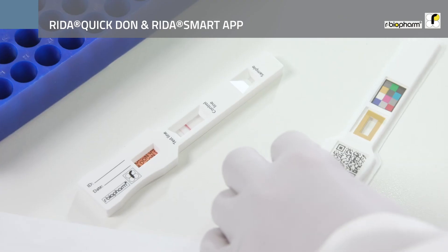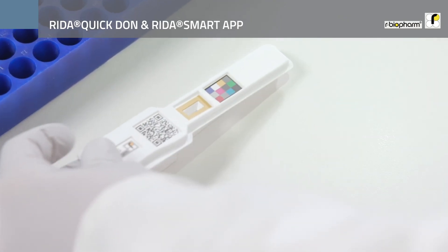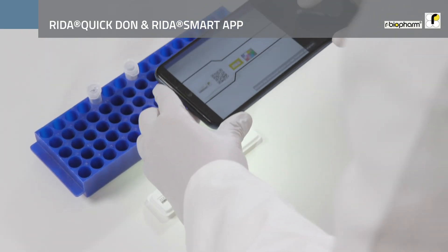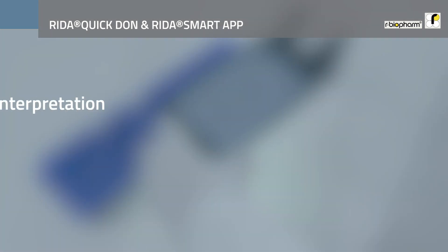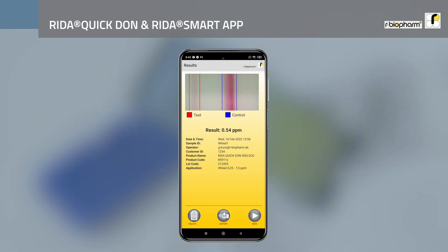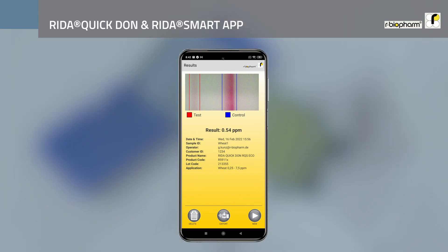Before you can start the measurement, put the cover on the test strip. Press the Next button, place the phone above the test strip and take a picture. After the image has been acquired, the result window appears. In addition to the test result, all important information about the measurement and an image section of the test strip are displayed here.